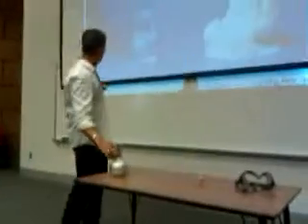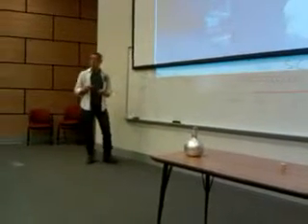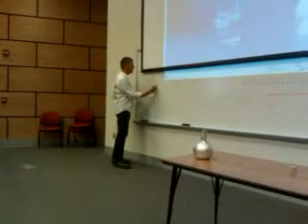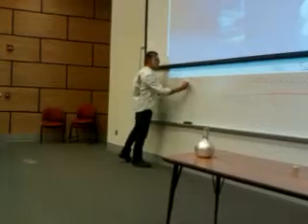All right, so what did we do? We added the catalyst. The catalyst increases the rate of reaction so fast, and it's an exergonic reaction, that a lot of this water boiled. It turned to gas. And so we ended up with hydrogen peroxide turning into water and oxygen gas.